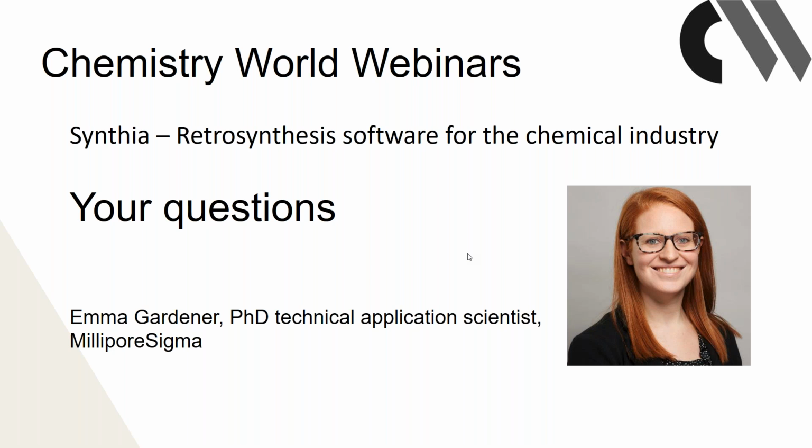Excellent. Well, lots of people had asked that, so thank you very much. So you talked about one of the advantages of these being hand coded, but Shota would like to know if you're going to apply this program to a novel machine learning system. So do we want to take it out of being hand coded, or in addition to that have a machine learning approach? Yeah, that's another great question.